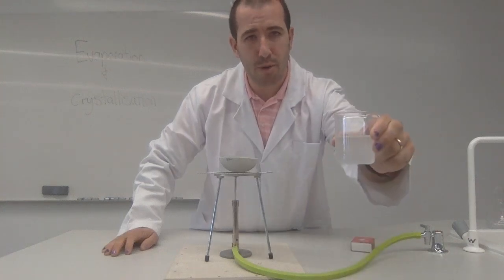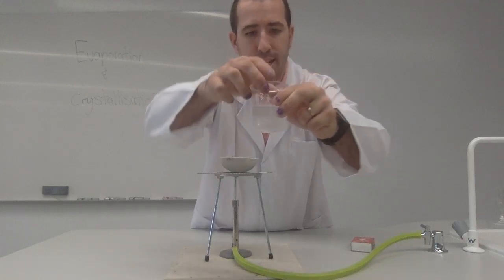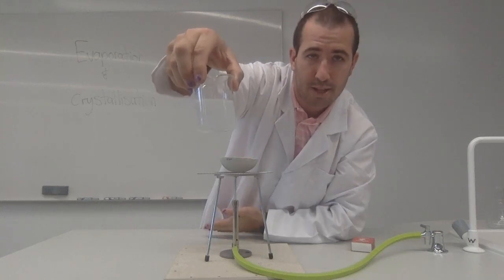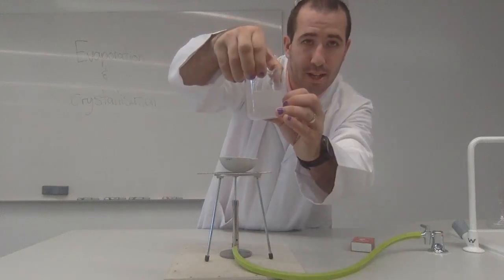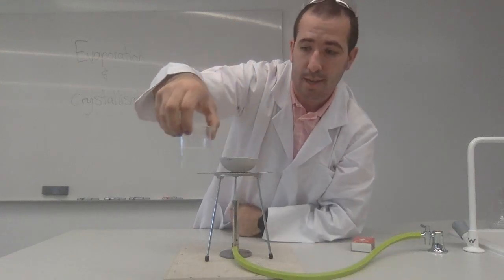Now, can anyone tell me what is in this mixture? I just picked it up, but as you can see, it's a little bit cloudy. Obviously, a bit of water in there, most likely. But what is actually inside of this? So what we're going to do today is try to see if we can separate out whatever's dissolved in this mixture and see what is actually left over as our substance.